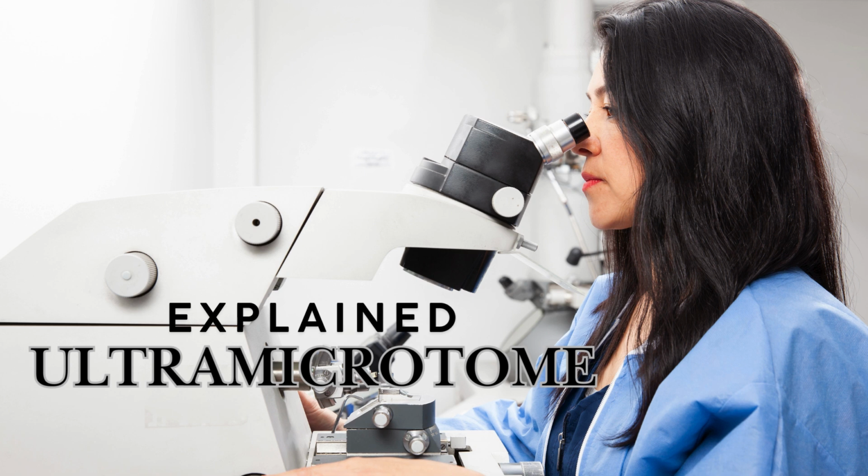So we've gone from slicing impossibly thin samples to the evolution of language. All thanks to this machine. It's amazing. But it's not just about language. Think about the impact the ultramicrotome has had on your life. Vaccines, new materials, even our understanding of diseases. All these things have been advanced by being able to see this microscopic world in such detail.